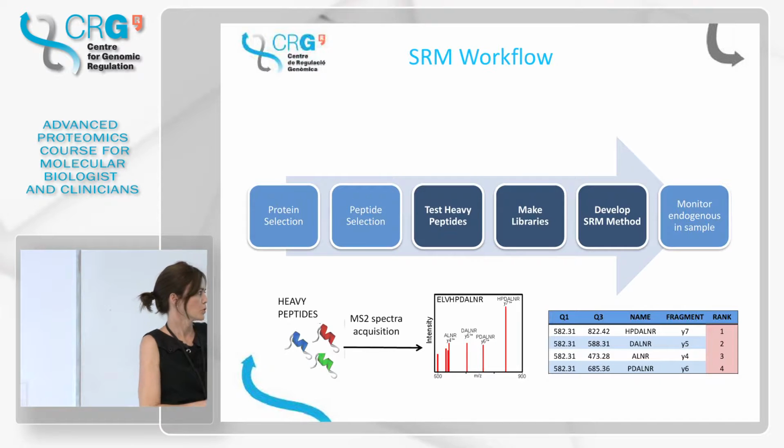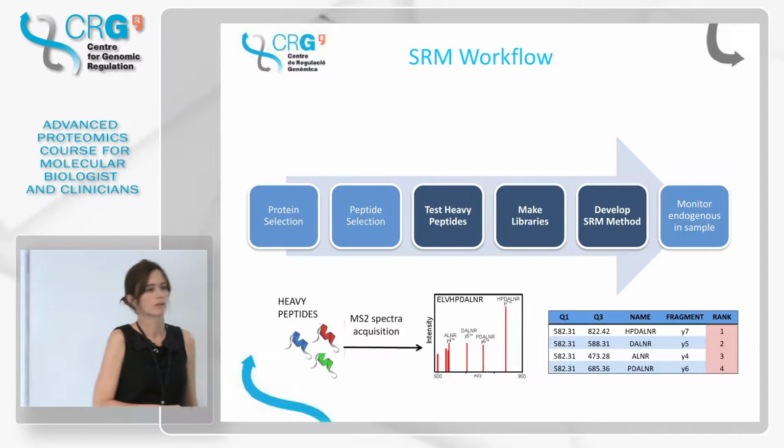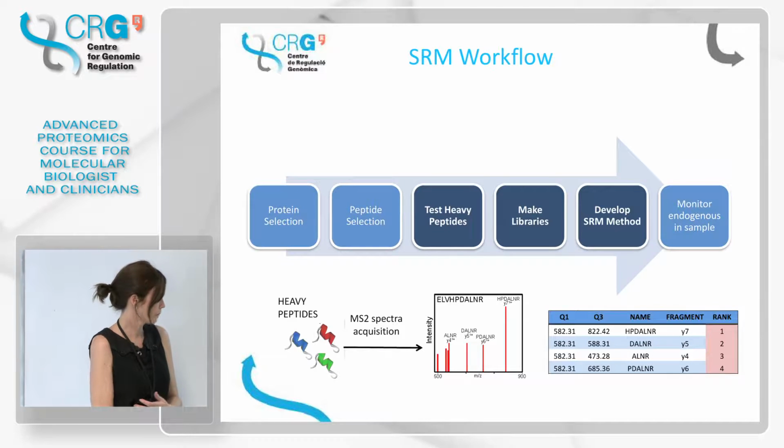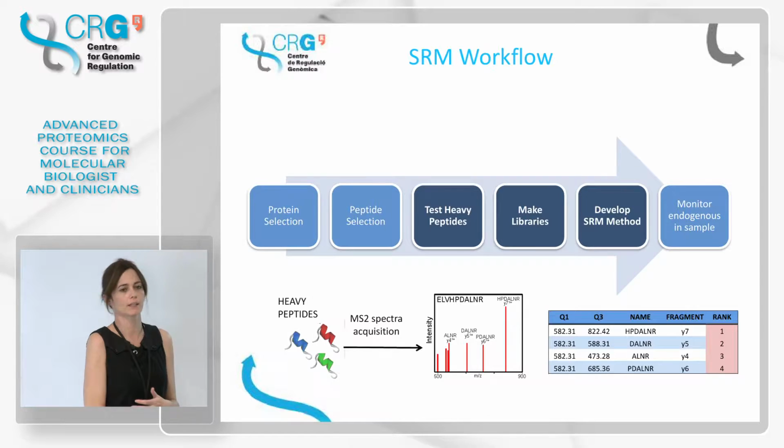Okay, so you chose your peptides, you bought your heavy peptides, you made your libraries, and now is what we properly call developing the SRM assay. Which is giving all these parameters to the instrument to monitor the peptides that you want to monitor.